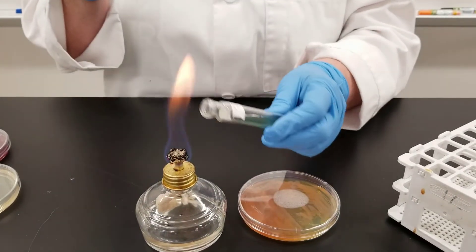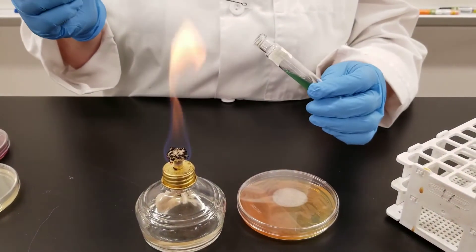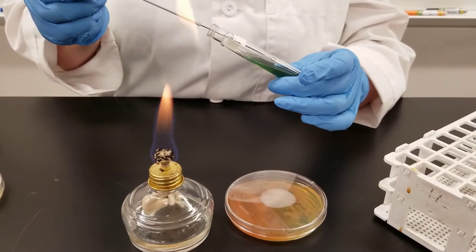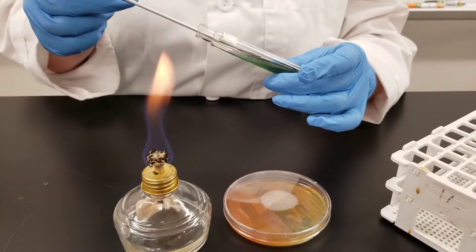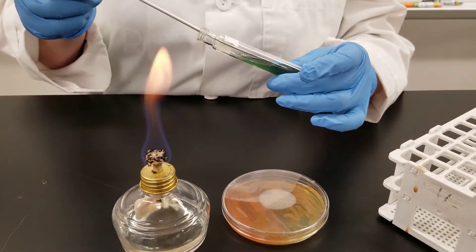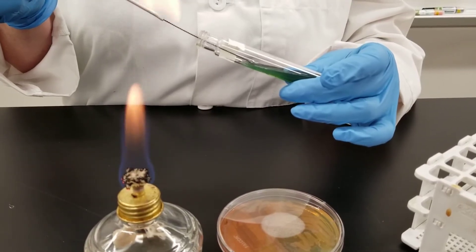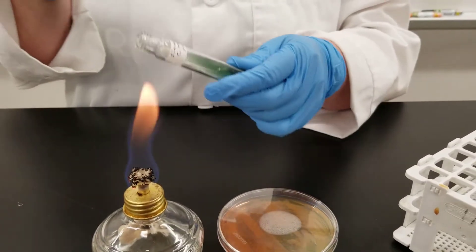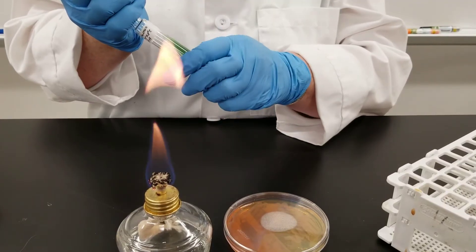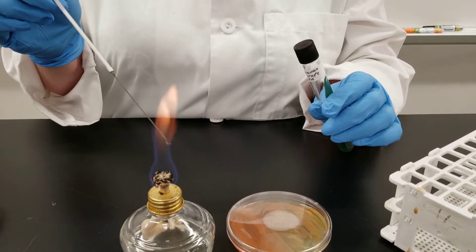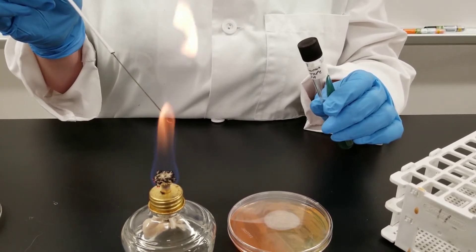We're going to flame the lip of the test tube to sterilize anything in there, bring our loop down to the bottom and then just streak up. The idea is that our inoculum, our bacteria, is going to inoculate along that slant of the tube. Flame the lip of the tube again before closing it and once again flame your loop.